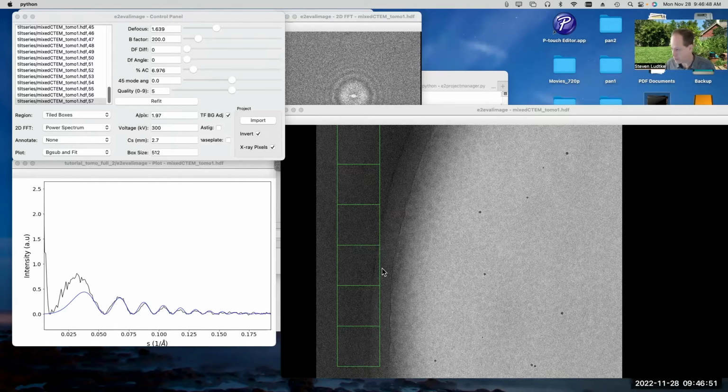And then based on that known geometry, it makes a forward model, and it says, okay, if the defocus in the middle of the image is 1 micron, then the defocus here should be 1.2 microns, and here it should be 1.4, and here it should be 1.6. And then it computes an energy function for the entire tilt series, and then it minimizes the energy, or maximizes the energy, depending on how you look at it, by adjusting the defocus. The only parameter it's trying to determine is the defocus in the middle of the image.